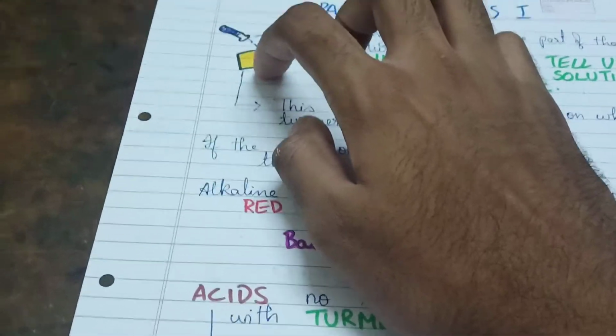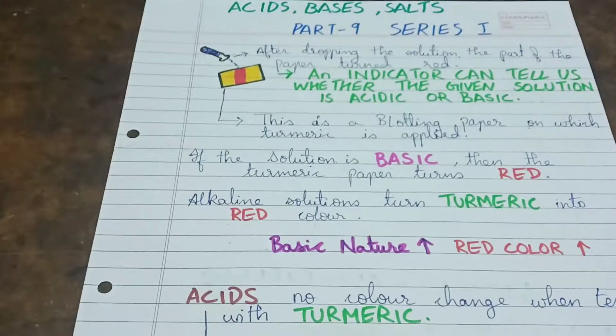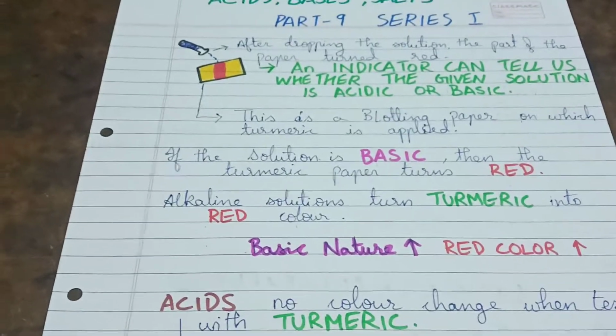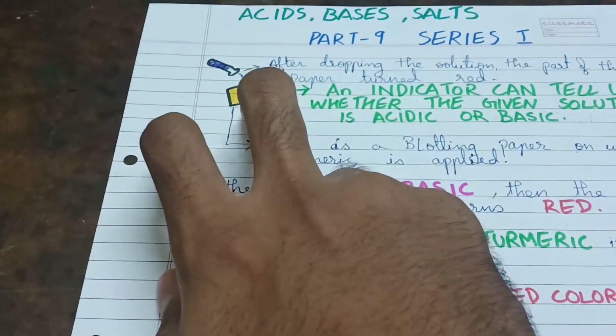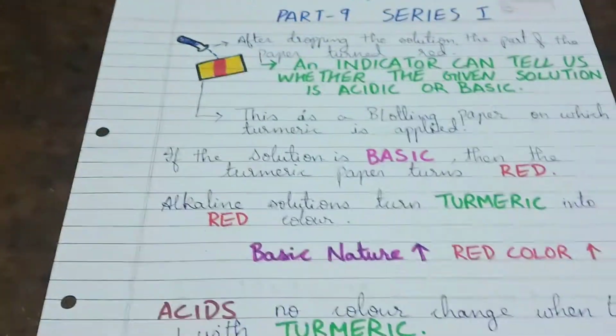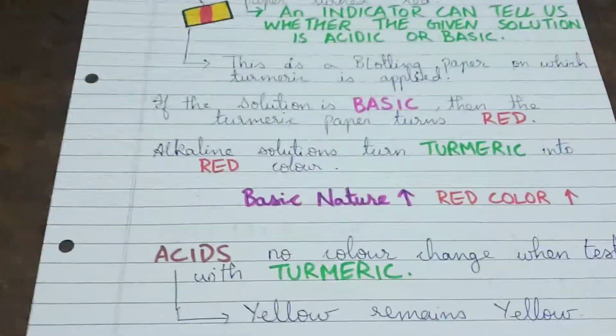The part where you pour the solution turns red because the solution is basic. If the solution is acidic, even if you pour it, the paper would still be yellow, because acids show no color change when tested with turmeric.